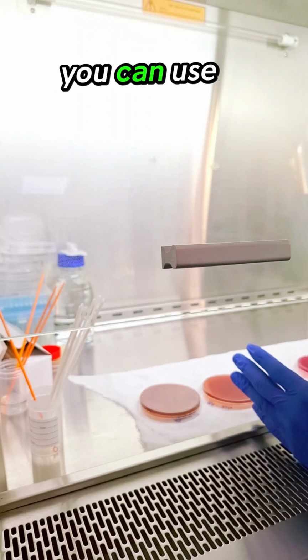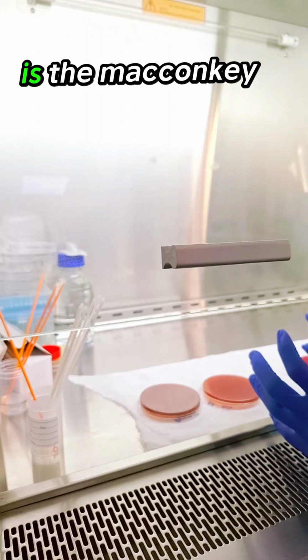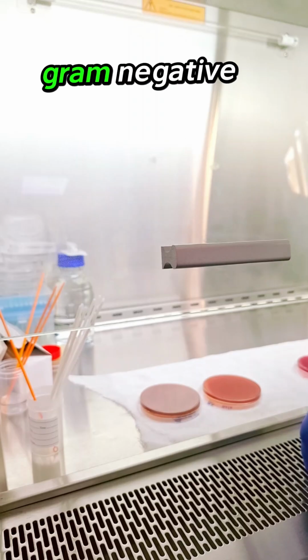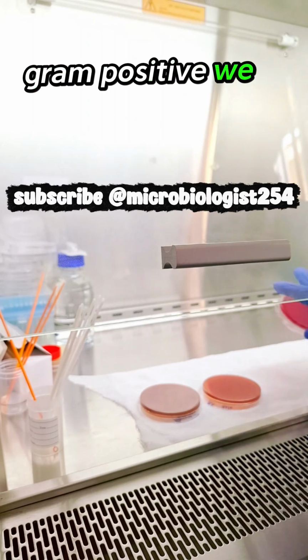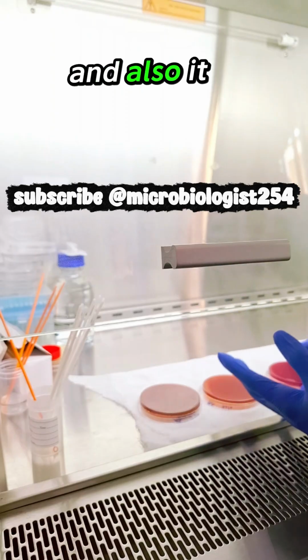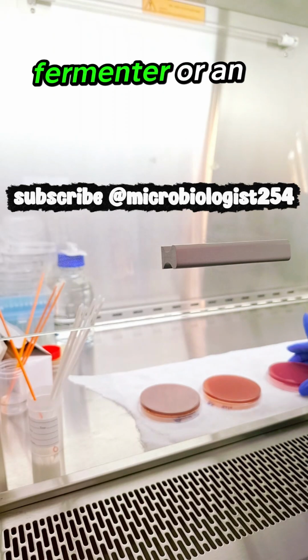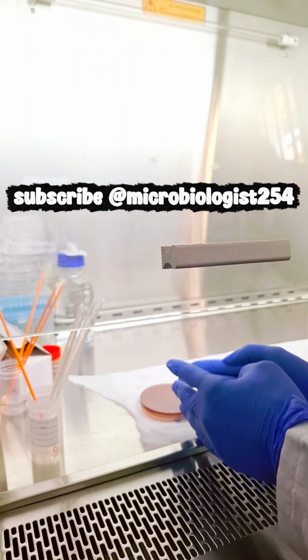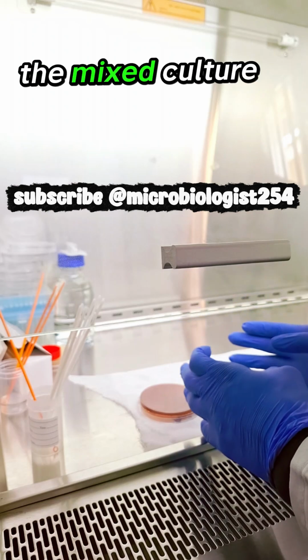The first media you can use is MacConkey media. MacConkey helps you identify whether the bacteria are gram positive or gram negative. One of the bacteria might be gram negative and the other gram positive. We have a MacConkey here. It can also help you identify whether the bacteria are lactose fermenters or non-lactose fermenters. That's why we do this test when we want to separate the mixed culture.